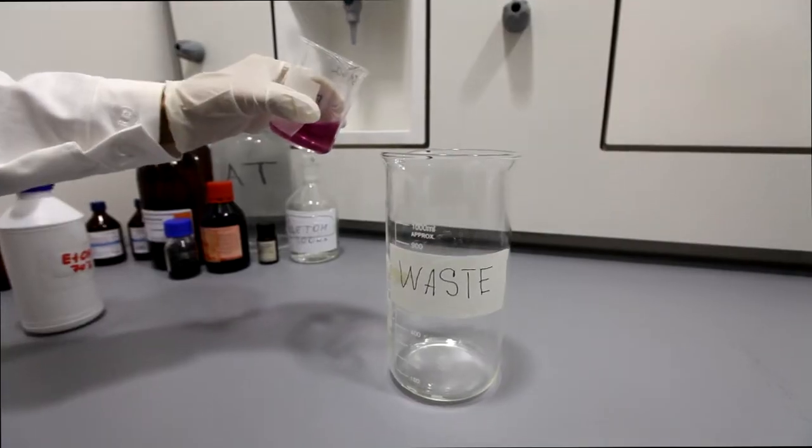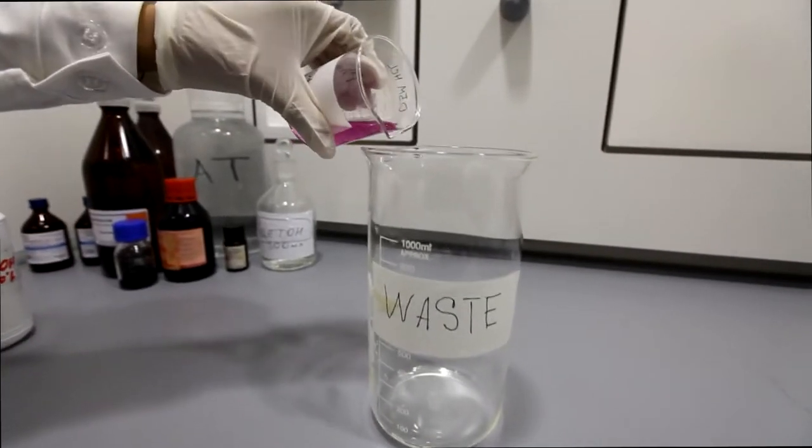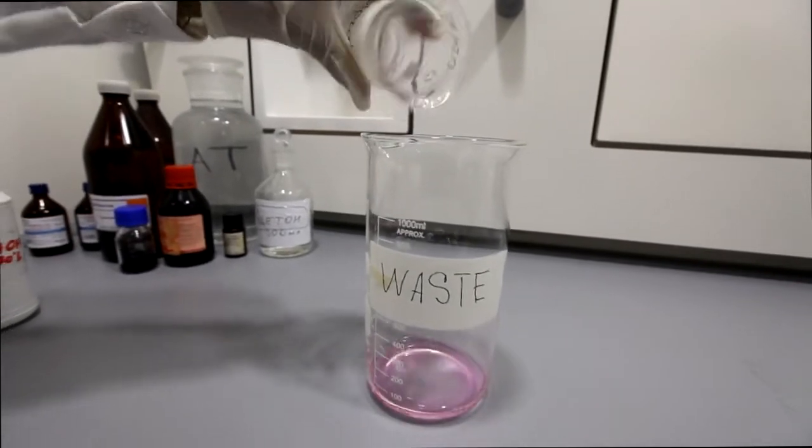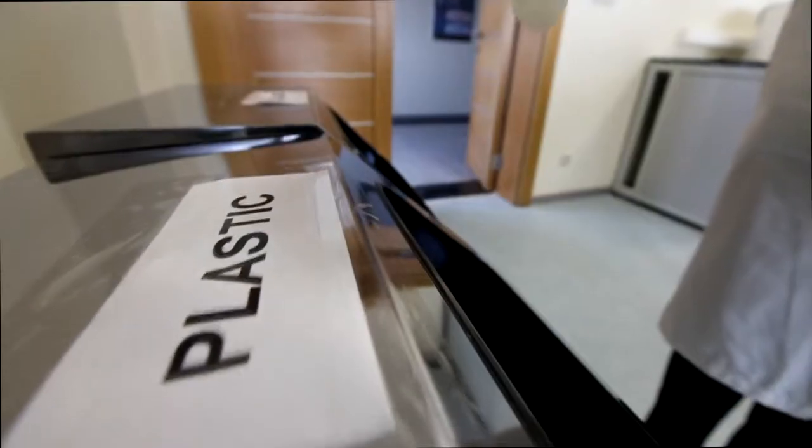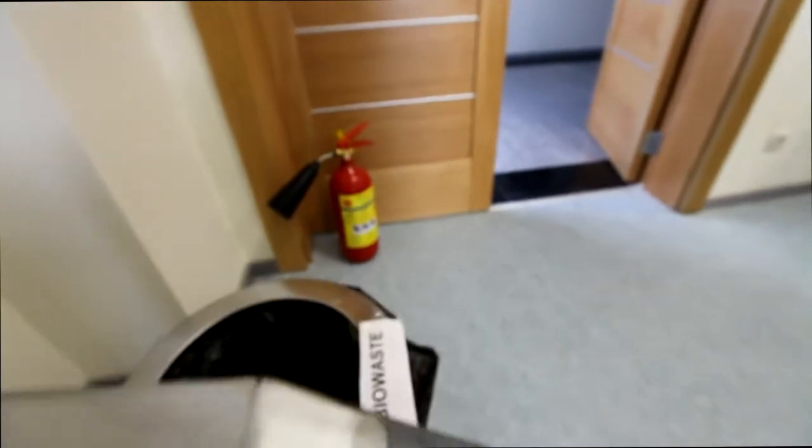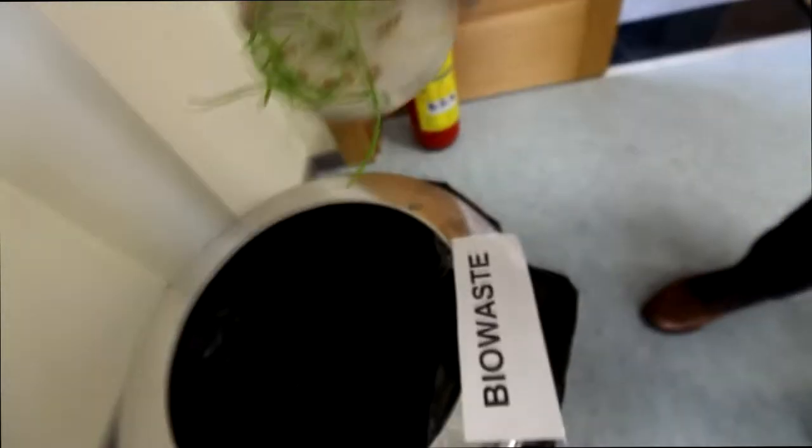Dispose of waste properly. Different types of containers will be provided. Dispose chemical waste in the beaker provided for this purpose. Plastic should be thrown into the bin for plastic, glassware into the bin for glass. Bio waste should be disposed in the container for bio waste.